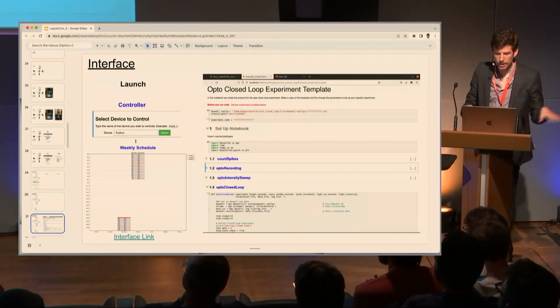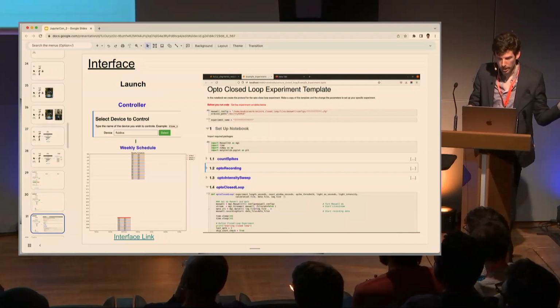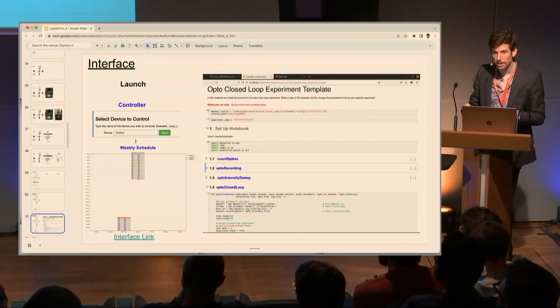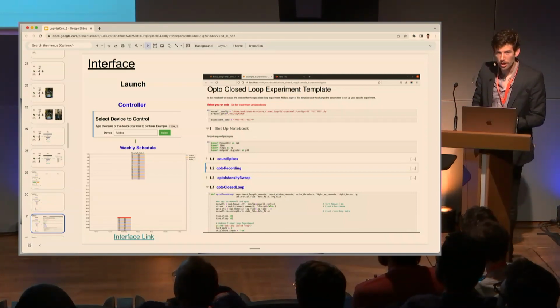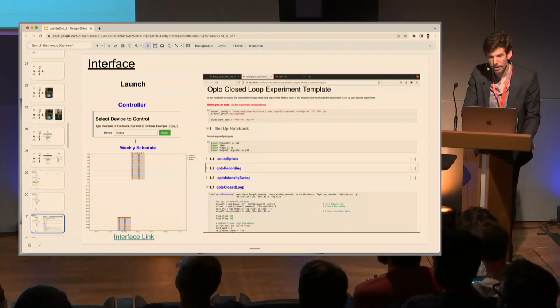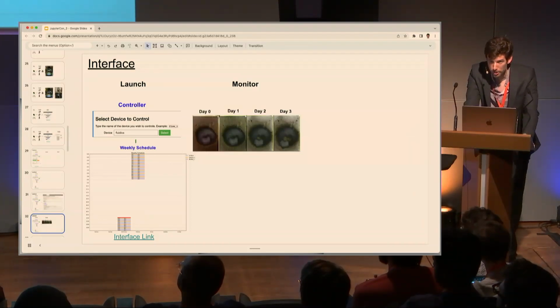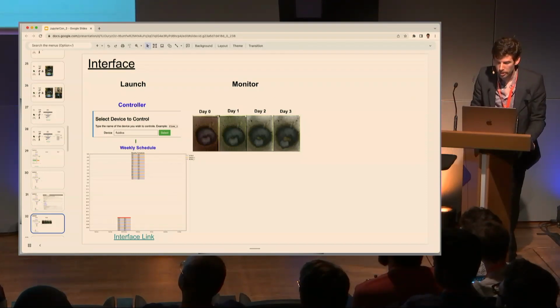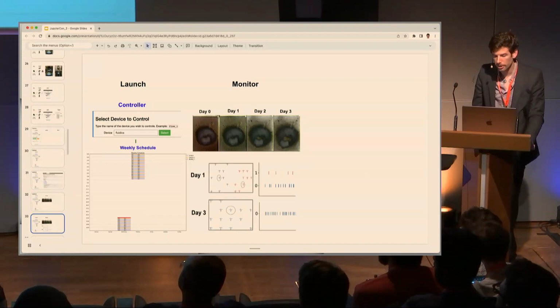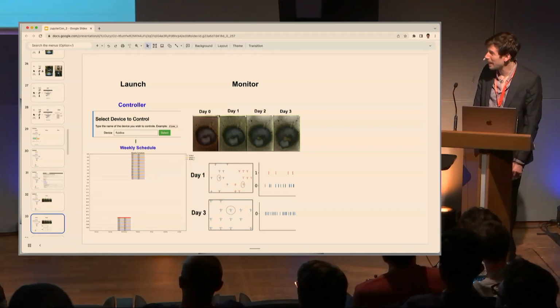So yes, we have these GUIs and widgets for some types of high level experiments, but for those really heavy computational experiments, we built some very good packages that allow us to control these closed loop experiments in a very easily defined way. The data from these experiments also is coming in live. So, as you're running it, you get real-time images automatically. You get real-time images of the different neurons and their communications with other neurons. I'm glossing over this, but that is a massive achievement.